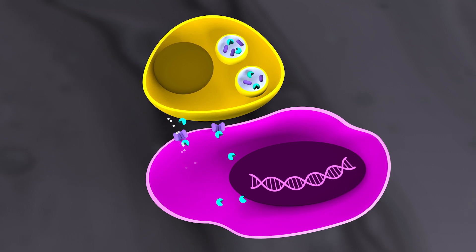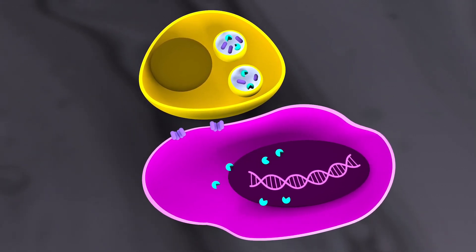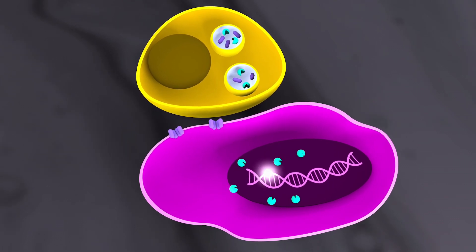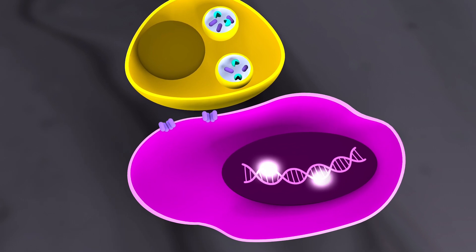At the same time, calcium flows in, making the pore formation visible under a microscope. Granzyme B activates nucleases, shown here as flashes of light, which cut the DNA in the cell nucleus into pieces.